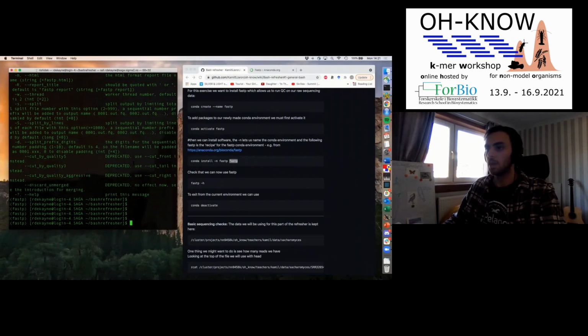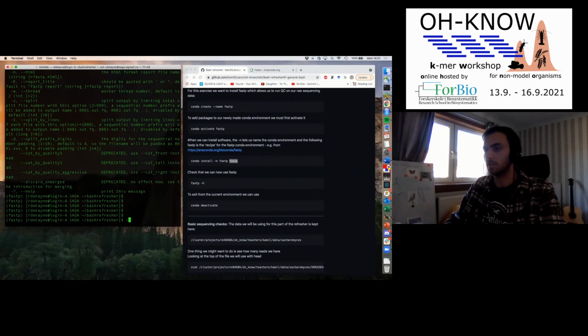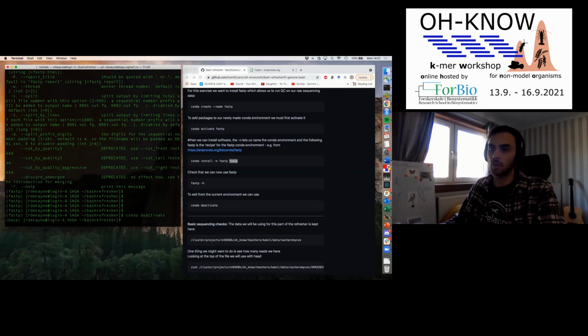If we want to leave the Conda environment, which is something you might want to do, you can do conda deactivate. You'll see now we're back to base.